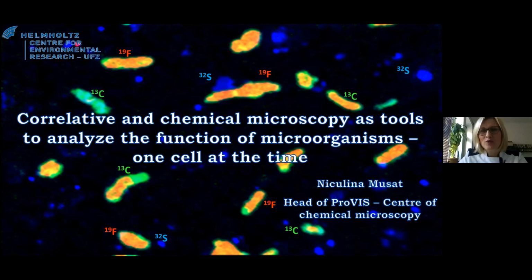I would like to talk today to you about tools to analyze the function of microorganisms. And actually, I am going to talk about single cell tools and how one can do correlative and chemical microscopy to analyze single cells in environmental samples.